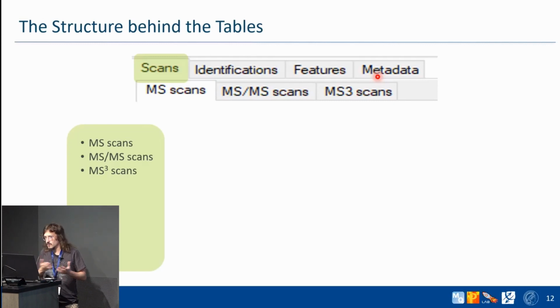I don't know which kind of experiments you are interested in or what you're going to do, but usually these are data that are more interesting and important for people that actually use the mass spectrometer. If you want to check how your mass spectrometer performed, if you find the correct identification window, for example, you go here and you can see the peaks and the outputs from the MS1, the MS2, and the MS3 also, if you have done that.